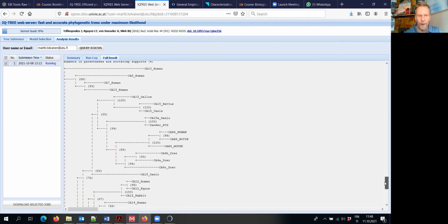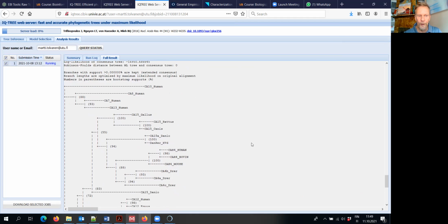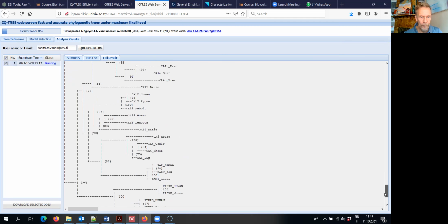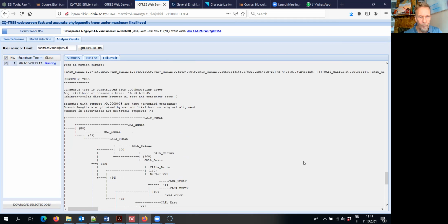And so the only thing where we can see the kind of deviant trees is that not all node values are at 100%, but many of them are more than 90%, and this is one of the weakest at 55%. And what else? No other poor nodes. Here's 58. So every single node is above 50%, so that is really a good result here.